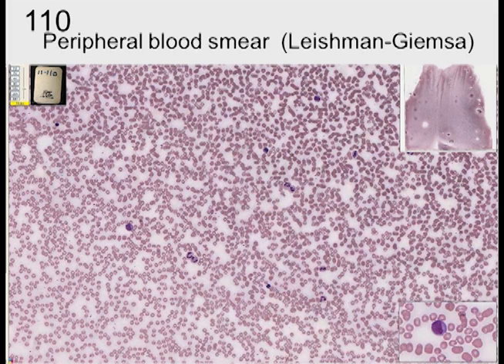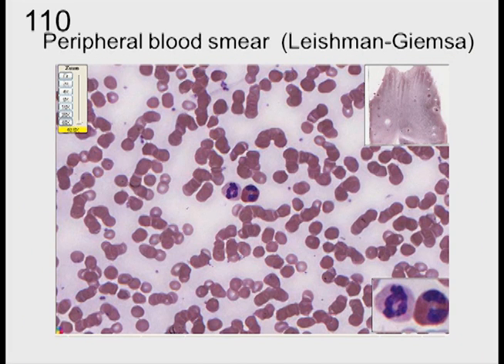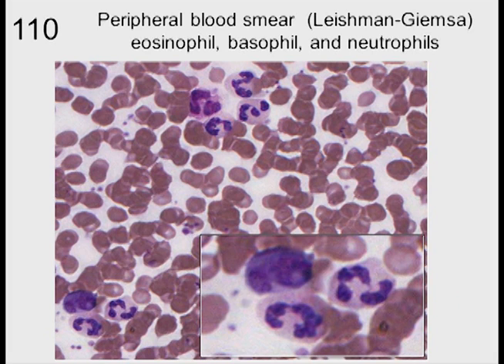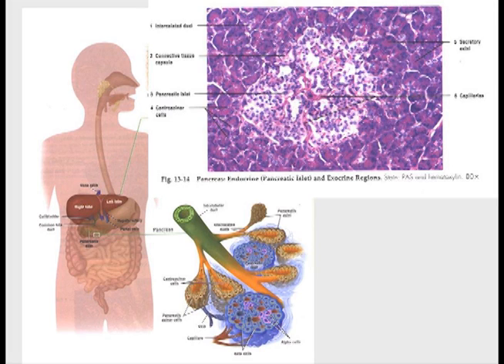Here we can see another set of neutrophils and a monocyte with lots of red blood cells. More monocytes, neutrophils, and a lymphocyte with many blood cells. Here we see a neutrophil and an eosinophil — you see big eosinophilic granules located in this cell. Here a little bit of a basophil, maybe, and some neutrophils that we can see. Again, neutrophils and eosinophils.